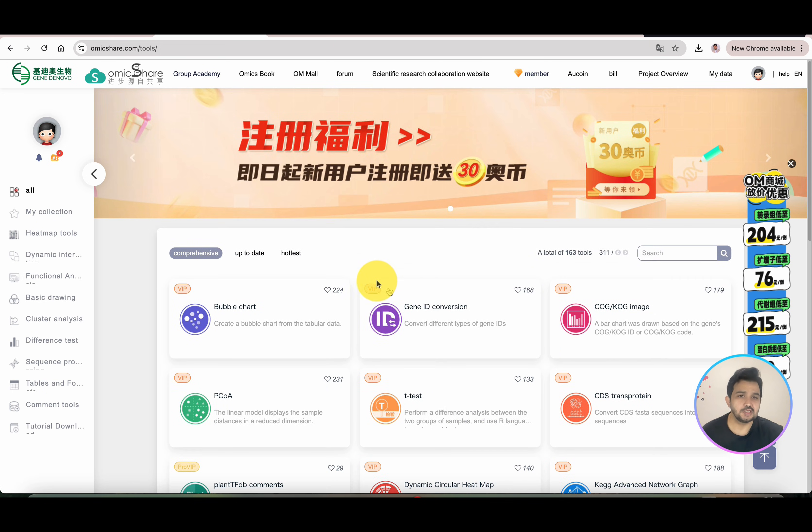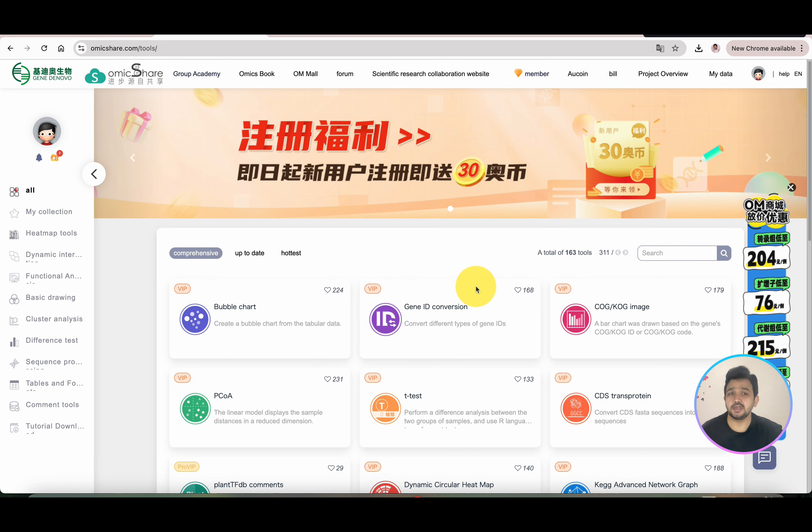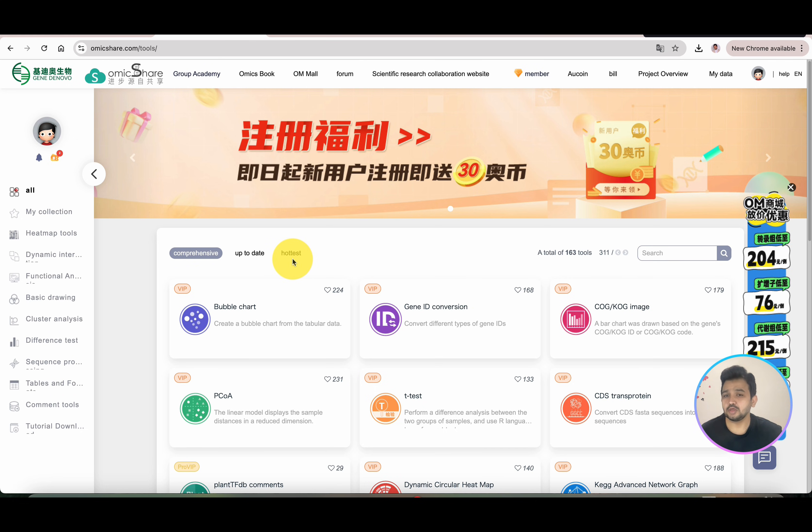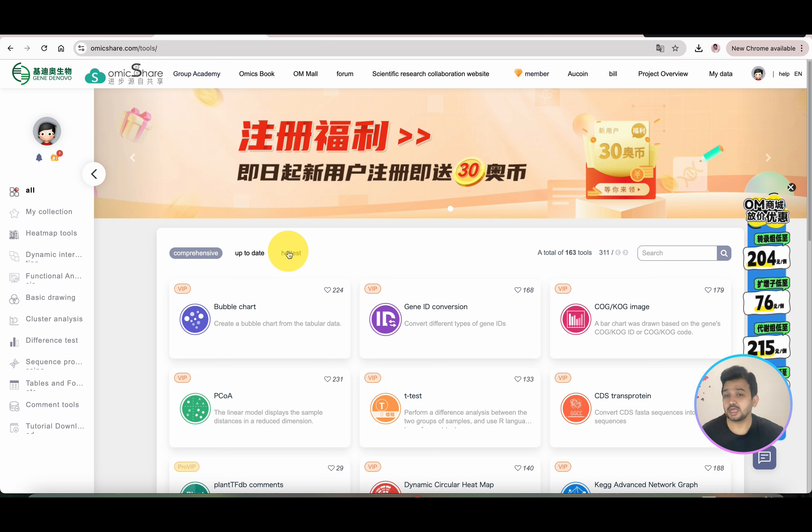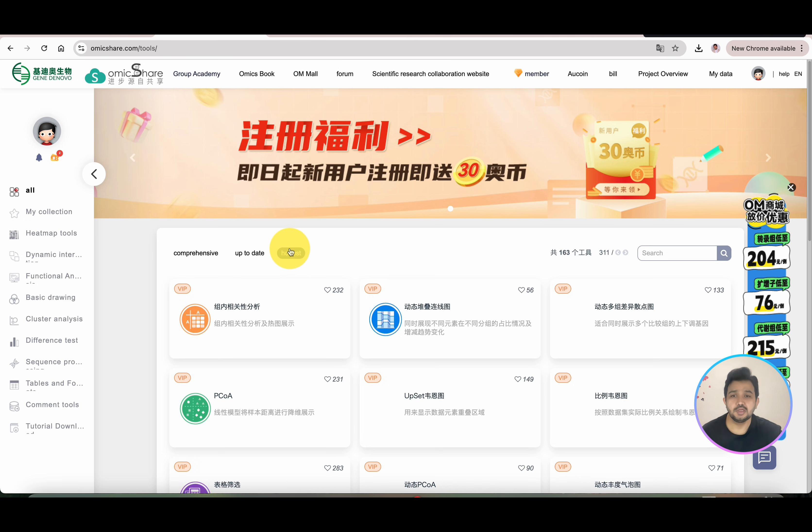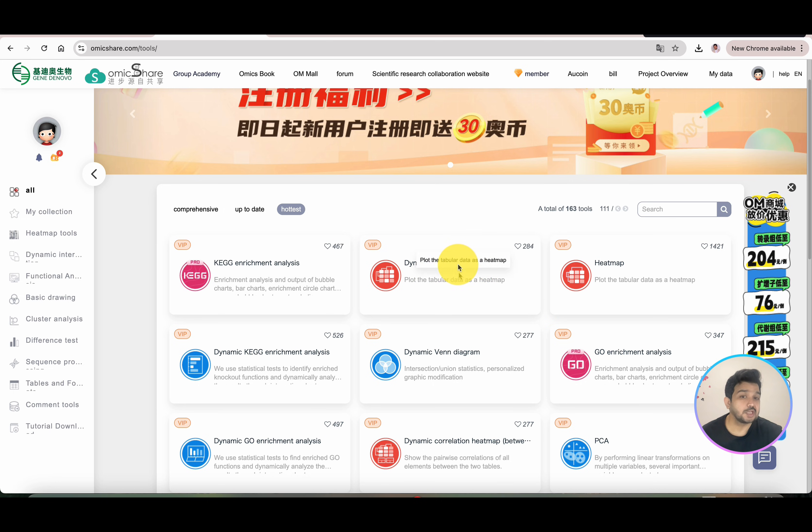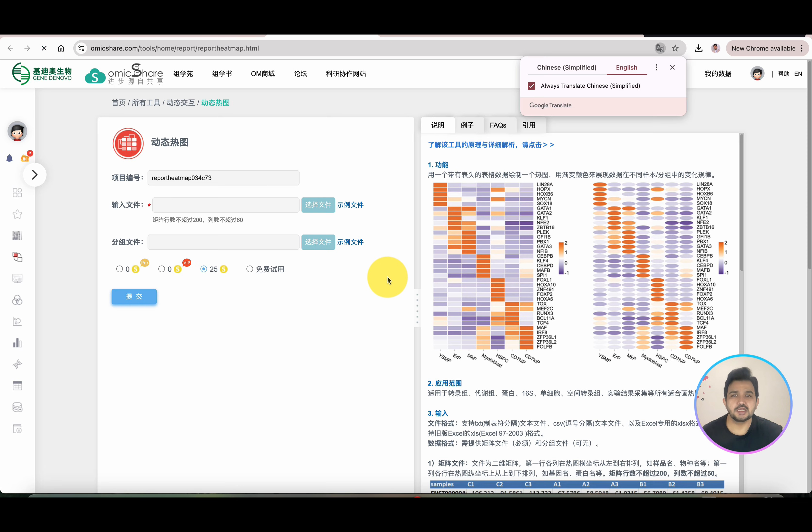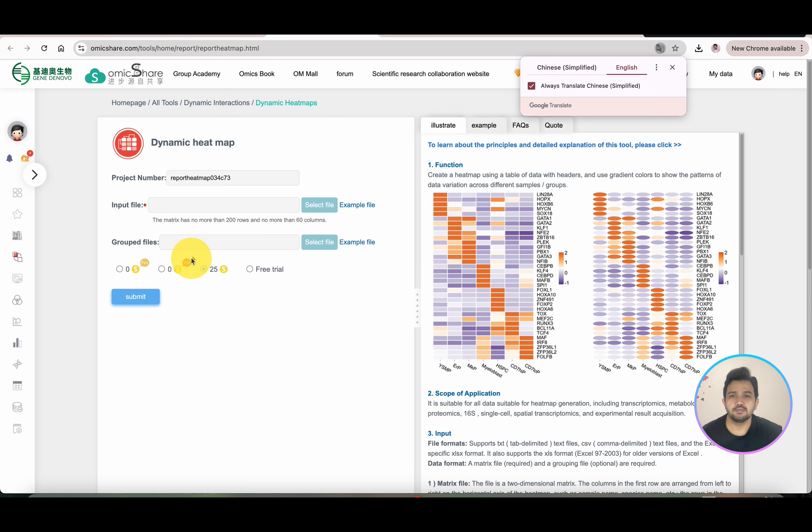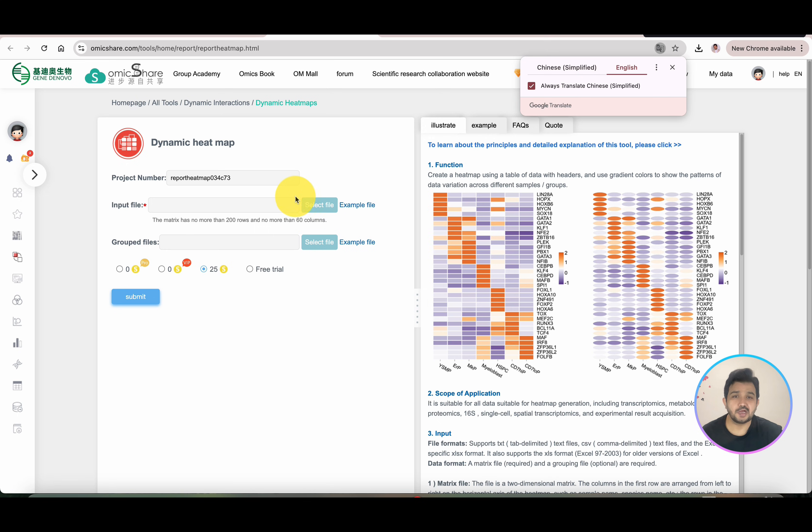I will not go into the detail of everything. I will show you how you can directly use one of its tools and demonstrate how you can prepare data. In the Hottest category, you can see we have the Dynamic Heat Map. Once we click on this dynamic heat map, it will ask you to upload your input file.